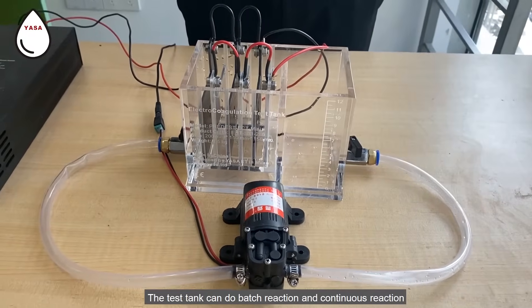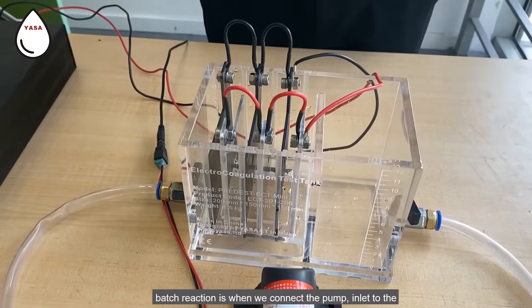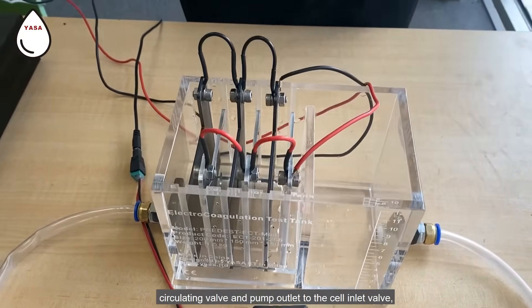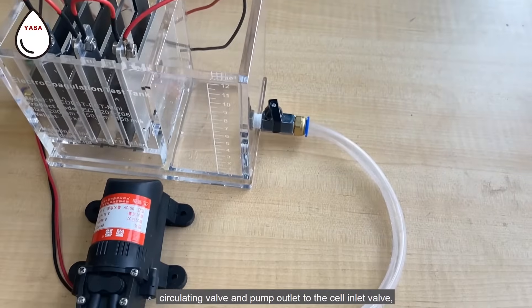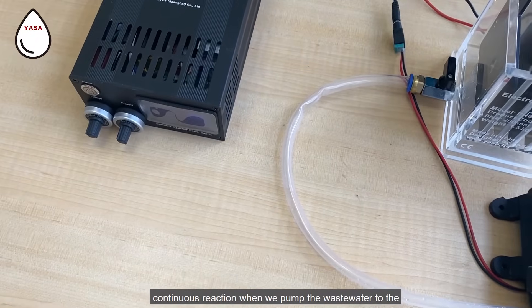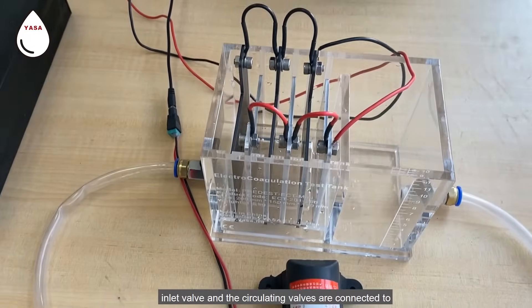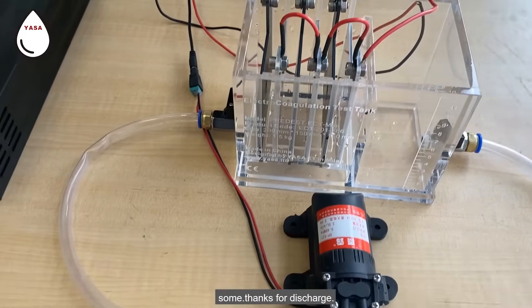The test tank can do batch reaction and continuous reaction. Batch reaction is when we connect the pump inlet to the circulating valve and the pump outlet to the cell inlet valve. Continuous reaction is when we pump the wastewater to the inlet valve and the circulating valve is connected to a tank for discharge.